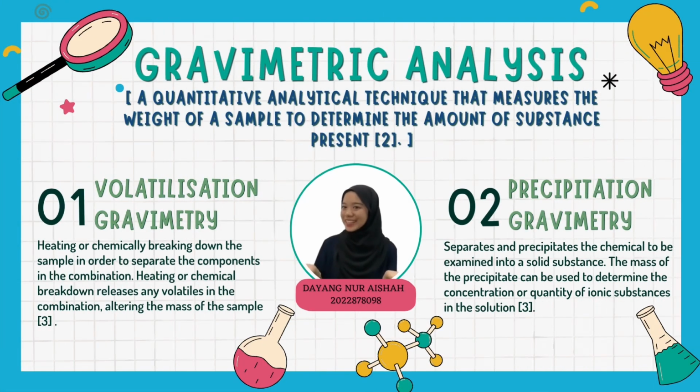What is gravimetric analysis? A quantitative analytical method called gravimetric analysis is a method used to calculate how much of a certain material is present by weighing a sample. The foundation is based on the principle that the mass of a substance is directly proportional to its quantity.